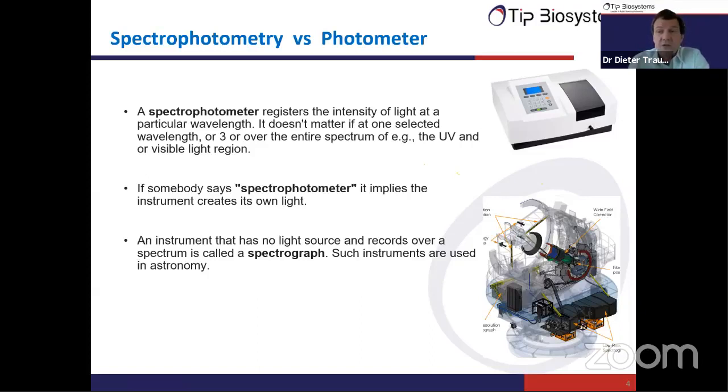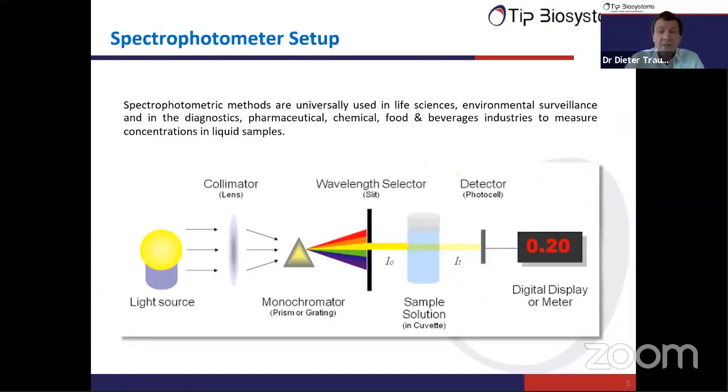Okay, now let's go a little bit deeper. How is the spectrometer designed? What are the components? So here we see a typical setup of a spectrophotometer. As mentioned, it has a light source, but in most spectrophotometers the light source is not monochromatic light. It's white light, and white light contains all the different colors and all the different wavelengths. Typically this light source in a spectrophotometer, we call it a tungsten lamp or something like this.